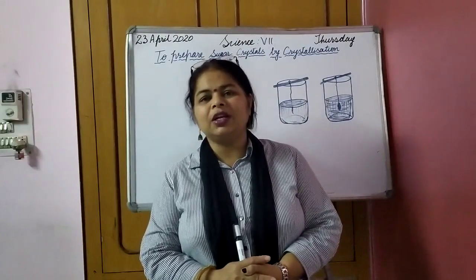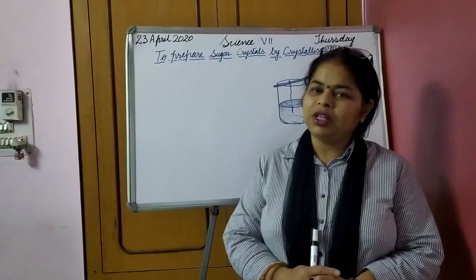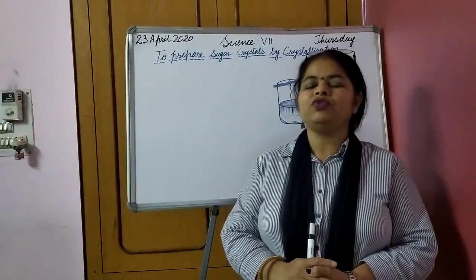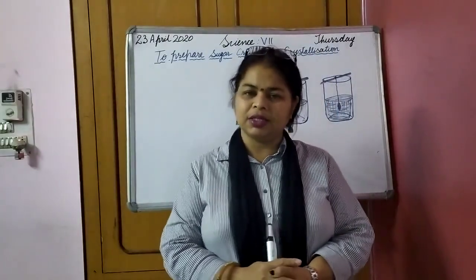So yesterday we learned it theoretically. Today we are going to learn with the help of an activity in which we are going to prepare the crystals of sugar by crystallization.